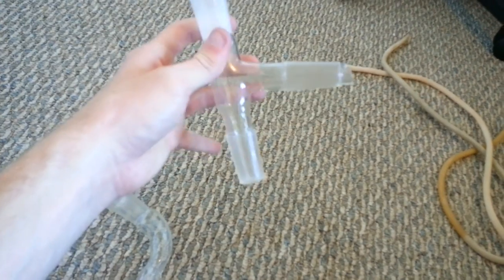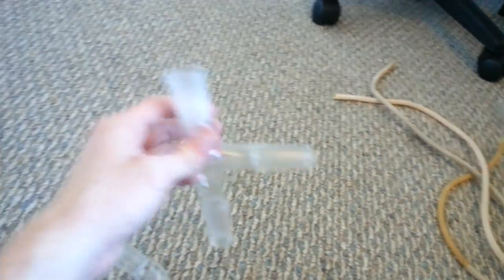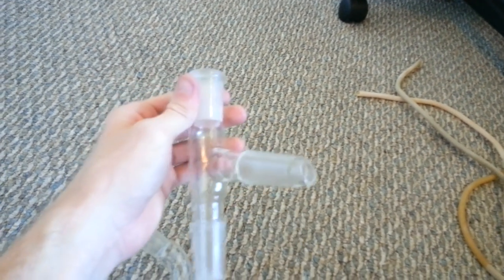This thing is for doing distillation. This side goes into your round bottom flask — liquid boils up and then it comes down into the big fancy condenser where it condenses and goes into a round bottom flask. You can either stop the top here or put one of the thermometer adapters so you can stick a thermometer in and figure out what temperature the vapor is. These will be used in other videos.